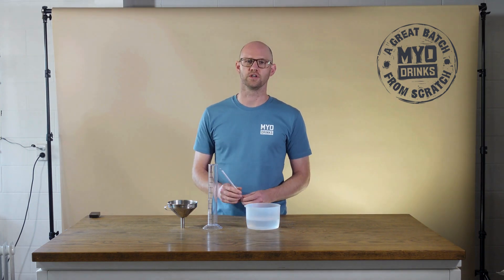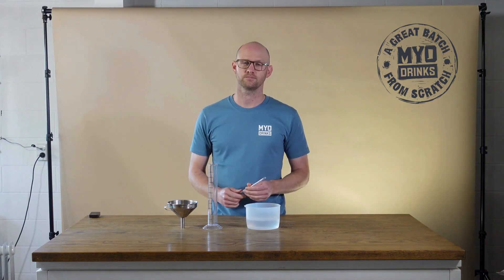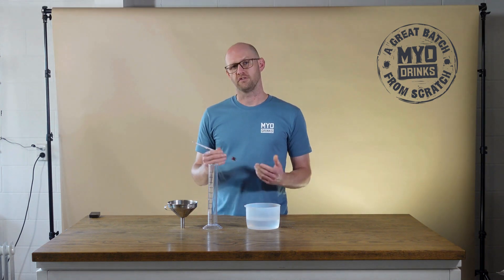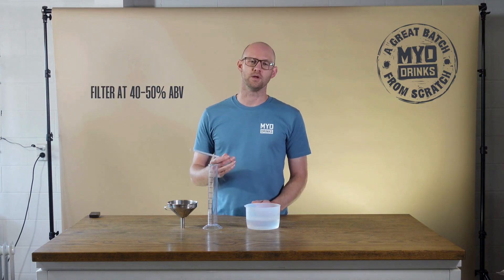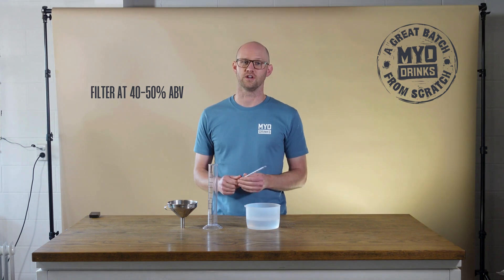An alcometer is useful for diluting distillate with water before filtering or ageing. For filtering, we recommend an ABV between 40% to 50%, or as specified in your filter instructions.